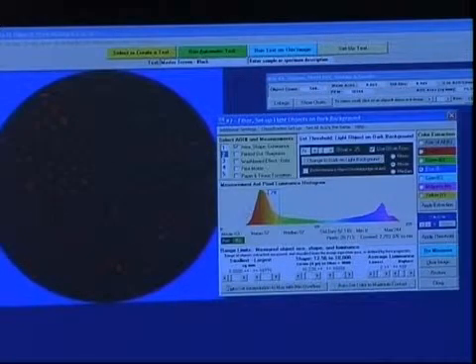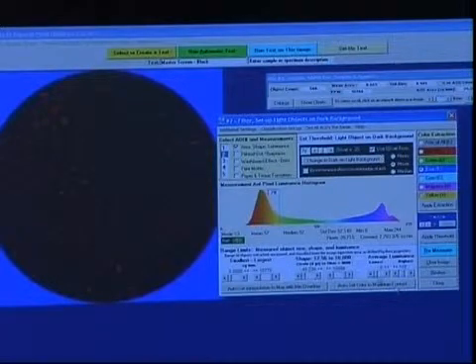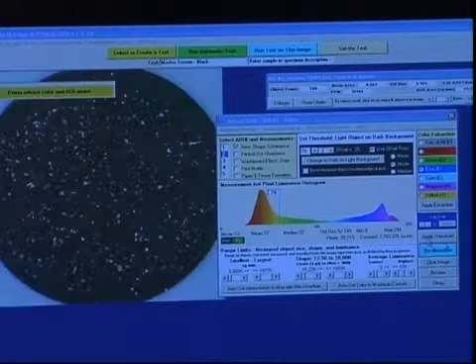It is set up at 0.08 again, but this time the shape is 45 to 10,000. So we want everything that is not round. And for the luminance, we want only the darkest of these, so it goes from 0 to 109. This was set up previously, and we'll go ahead and make the measurement.